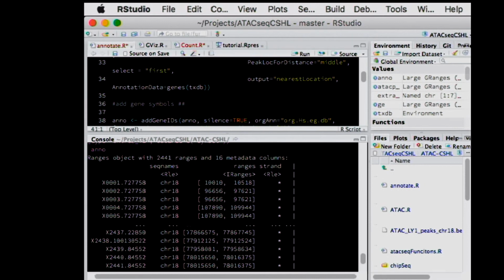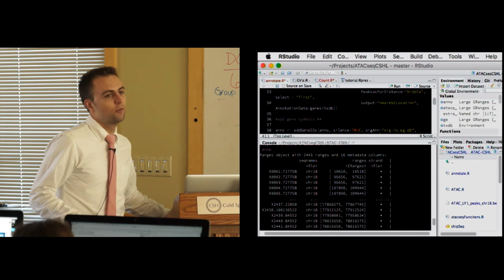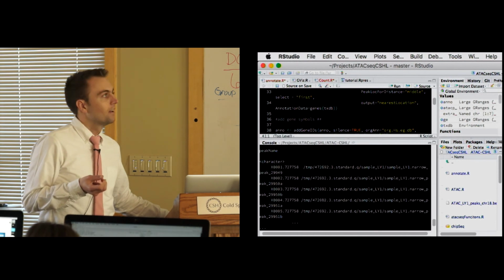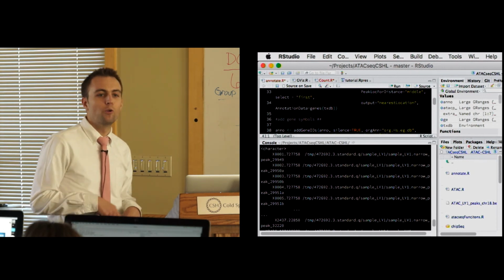What other ways could we get a sense of this, maybe from existing data? There's an enormous amount of data from ENCODE and other ChIP-seq experiments that are available, so we can look at overlaps of peaks with our called peaks and get a guess. All that information you can store in genomic ranges. It's a nice way to put everything into one holder.